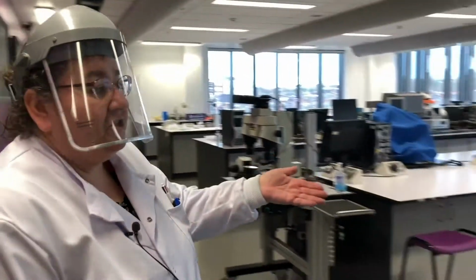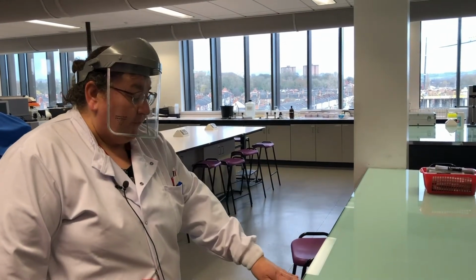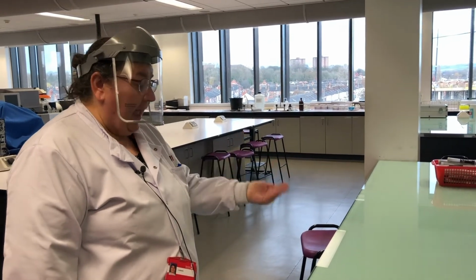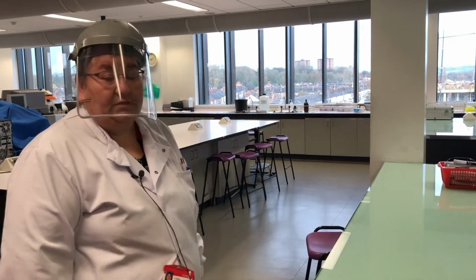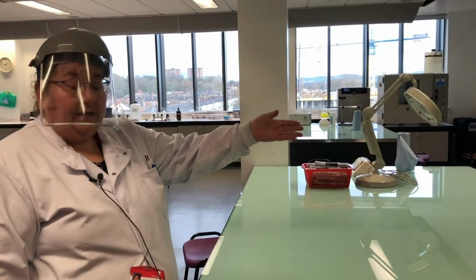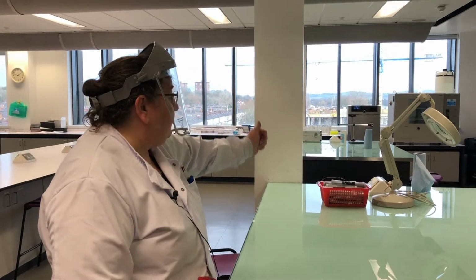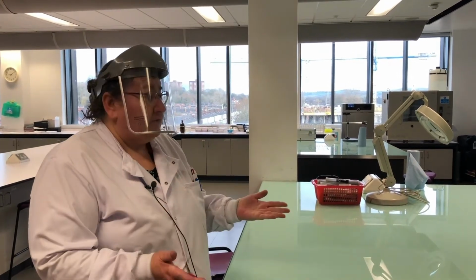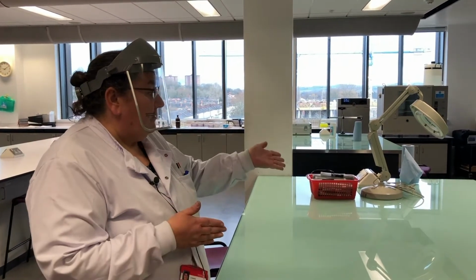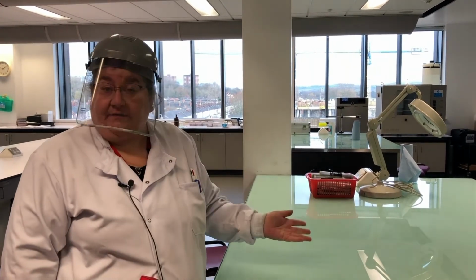We have glass-top benches that we use for our fingerprint development. So the students can feel free to dust the benches and look at evidence on there. It's easy to clean and it also means everything is viewable through the powders, whether it's magnetic or aluminium. We've got our fume cabinets for the developing of the fingerprints. We also do chemical developing there. Along with our humidity oven, we can get a nice range of the Home Office development processes, from the powdering, the ninhydrin, the indanedione through to our physical developer.